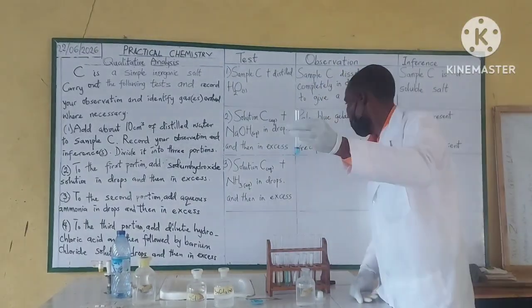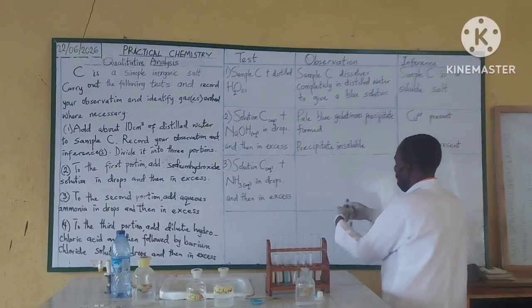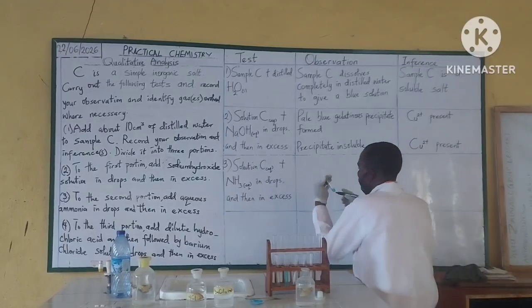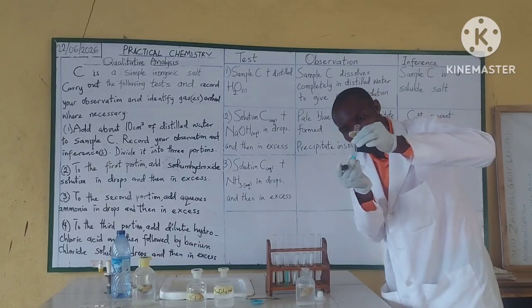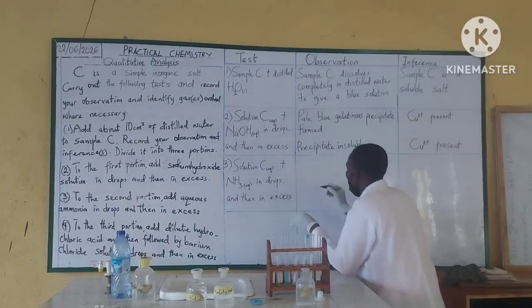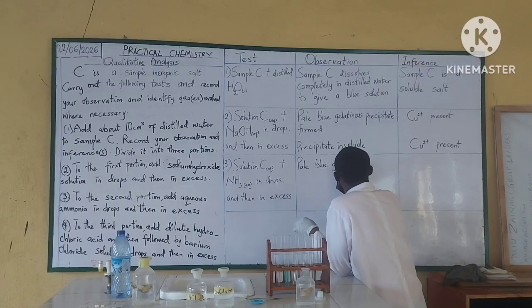As usual, we have pale blue gelatinous precipitate.